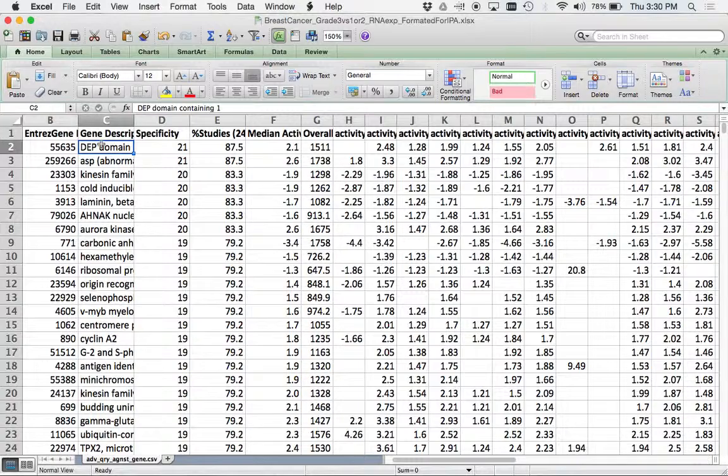I'm just curious, do they specify in the studies if it is coming from a comparison between cells coming from patients or cell lines that are usually representative for a certain state? We took them from tumors from people. So these were all tumor. Is it specified somewhere? Because a lot of studies just take cell lines that they say are representative of that stage, and sometimes it just compares cell lines.